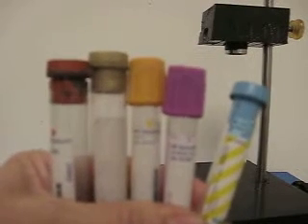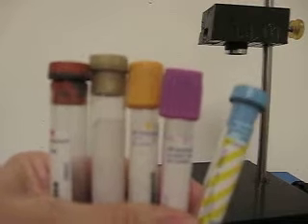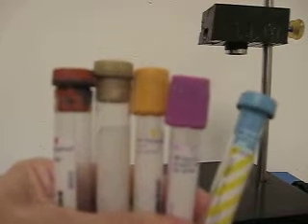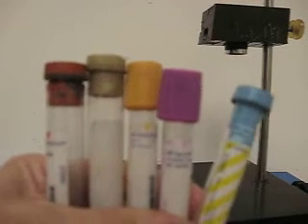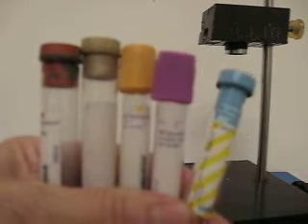I am demonstrating the decapper and capper for opening and closing those hard-to-open so-called twist-and-pull tubes, commonly used in clinical chemistry labs. There are also two tubes used in cell culture, and if you use snap-capped tubes.